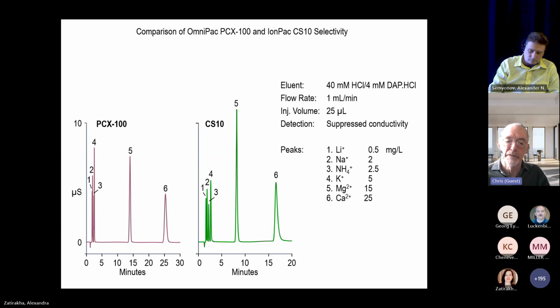But the problem with surface sulfonation is you have a cross-link gradient, because as the surface swells in water, the part that's at the boundary between the unsulfonated resin and the sulfonated resin can't swell as much as the part that's far away from it. And so you end up with a crosslink gradient, which puts the highest crosslink the farthest away from the surface, which is the worst place for the high crosslink to be if it's going to be a gradient.